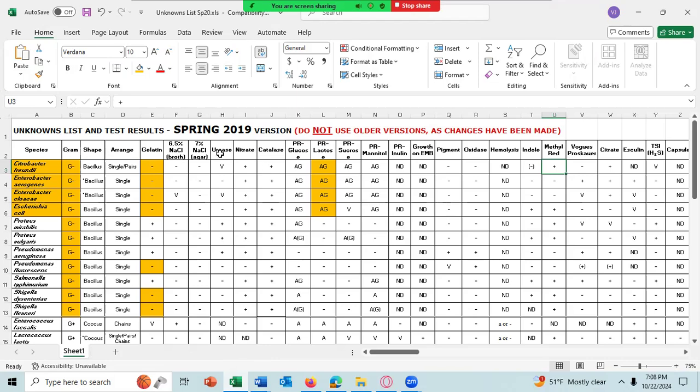And the tests are up here. The species are here. Decide on a test, and then read about the test, find out how long the incubation period is. Most of these tests have 2 days incubation, meaning if you request a test, I'll start it, and then after 2 days, I will send you the results. And I'll send you a picture of the results. Some of the tests you can get back within the same day or a day.